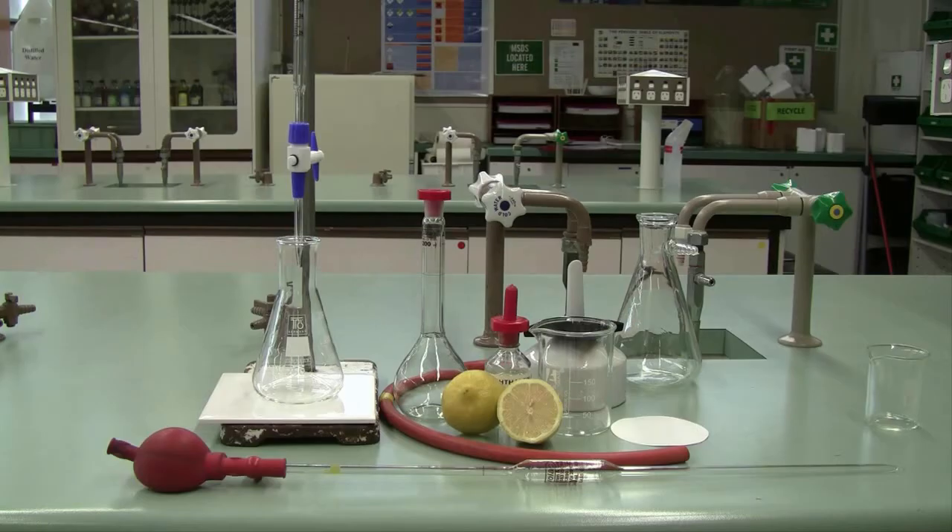Regarding your practical report, there are a few things to keep in mind. Today's experiment revolved around a chemical reaction between the citric acid and the sodium hydroxide. You're using a known substance — your sodium hydroxide — to find out about an unknown substance: the citric acid in your lemon juice. You can use stoichiometry and your three-step plan, along with all the tools in your tool belt, to navigate through the calculations and determine the concentration of citric acid. When we're after the percentage weight/volume of citric acid in the lemon juice, that simply means the number of grams of citric acid per 100ml of lemon juice. Once you think you've got your result, compare it with the class results — if it compares closely, chances are you're on the right track. Good luck.